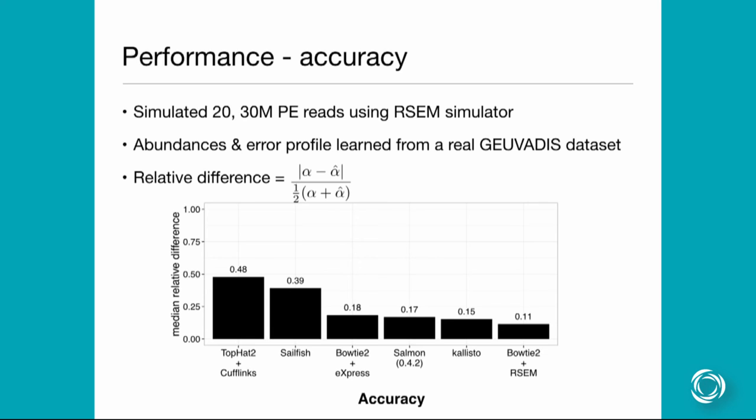If you're interested in novel isoforms, the best approach to take is really doing an assembly. An assembly is quite a bit of work. You need really good data. You need long reads, or preferably longer reads, and you need a lot of them. We can argue about that. But pretty much like any method, the method always assumes that you're starting with a good transcriptome. That's often a poor assumption, but there really isn't much you can do without doing the full assembly.